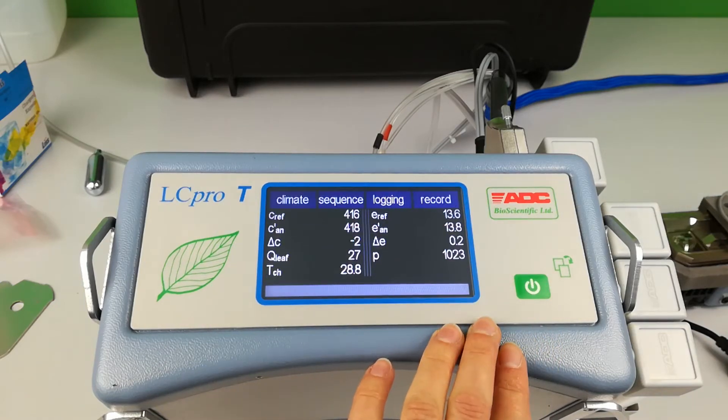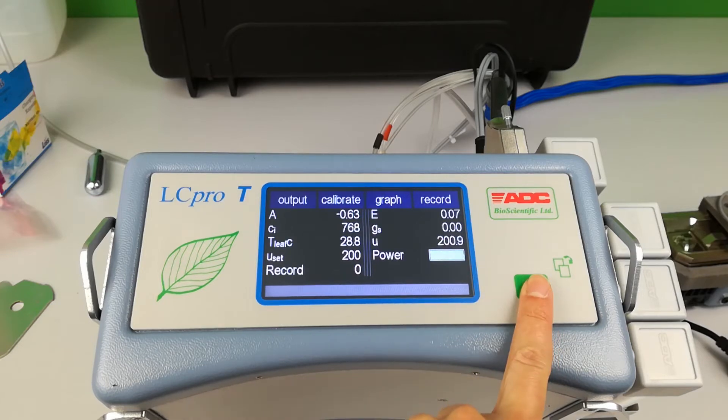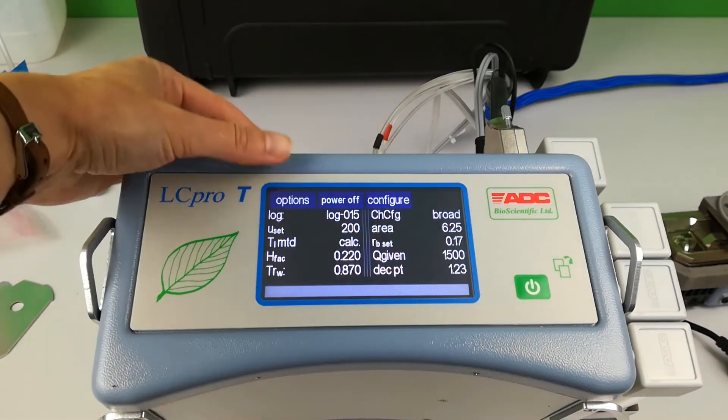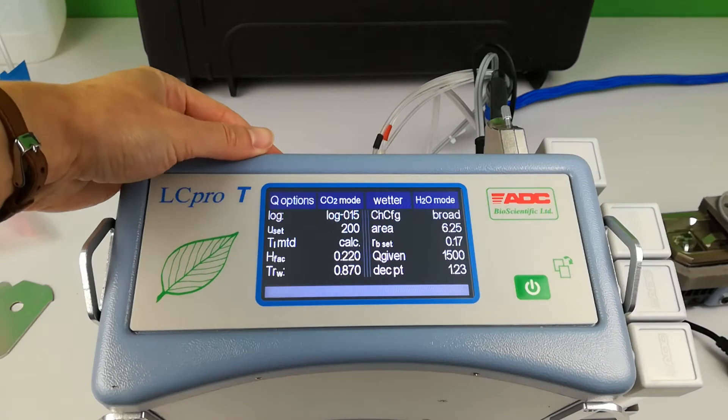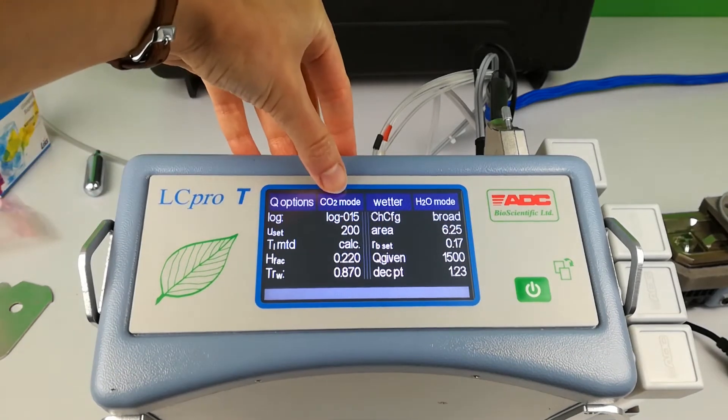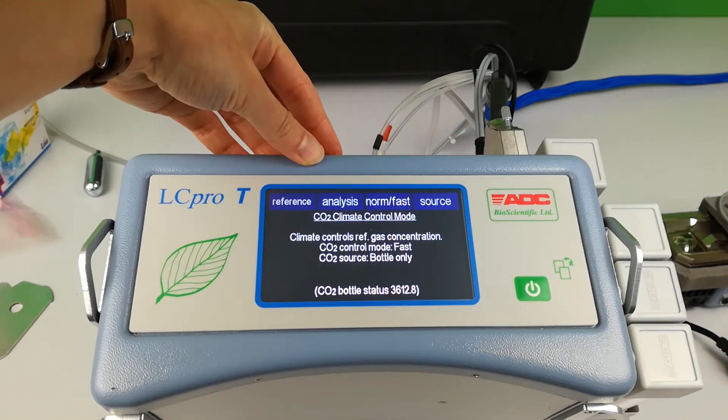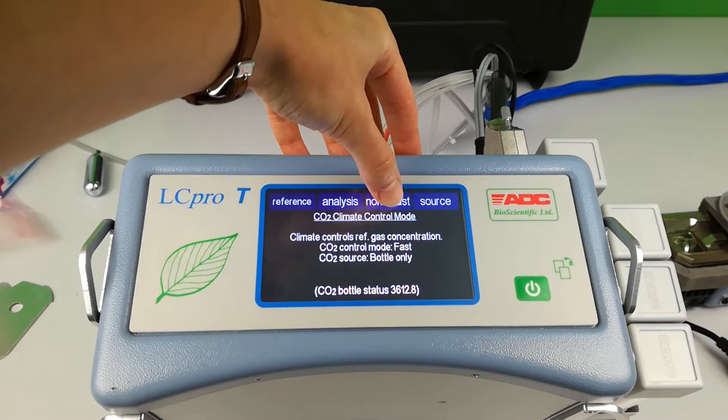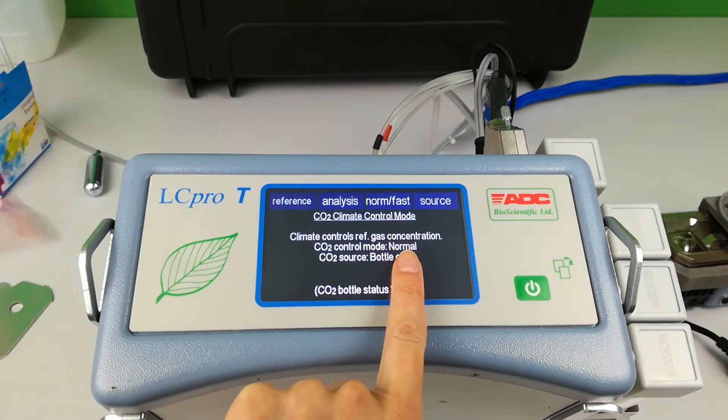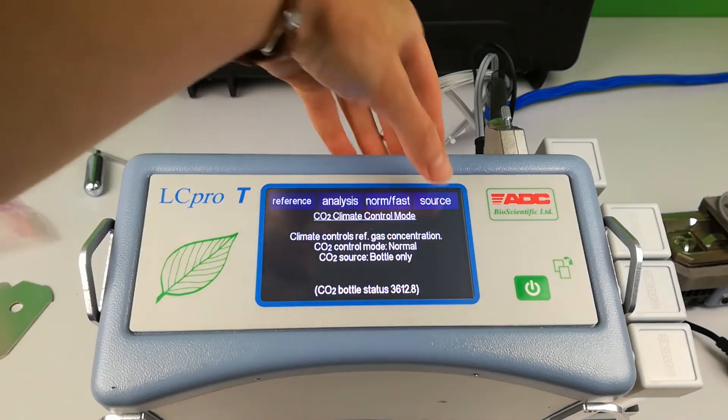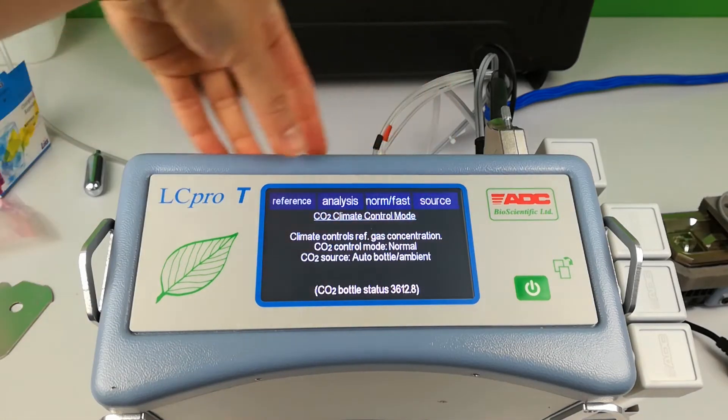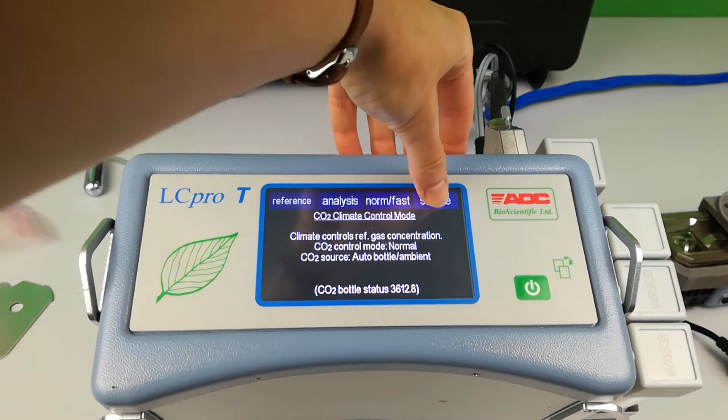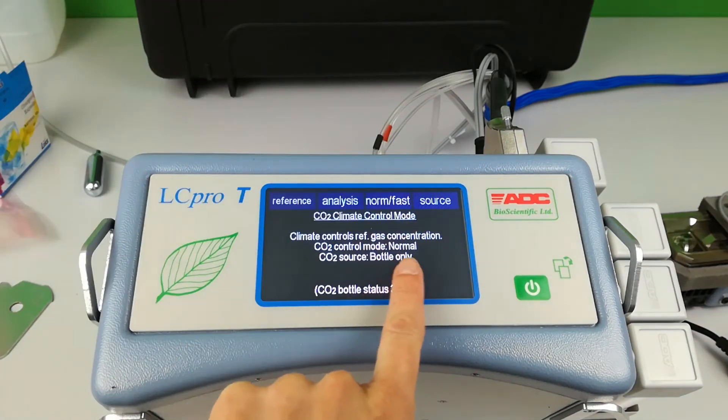C reference and C analysis can be viewed through the menus. Enter options and CO2 mode. Here you can control whether the CO2 is controlled in normal mode or fast mode. The source can also be changed. Bottle only indicates a CO2 cartridge is installed. Use the power page button to confirm.